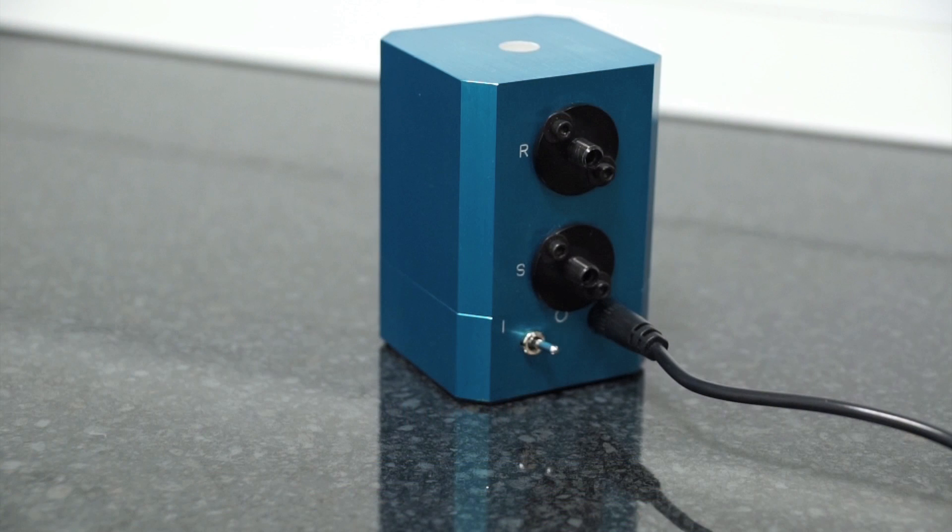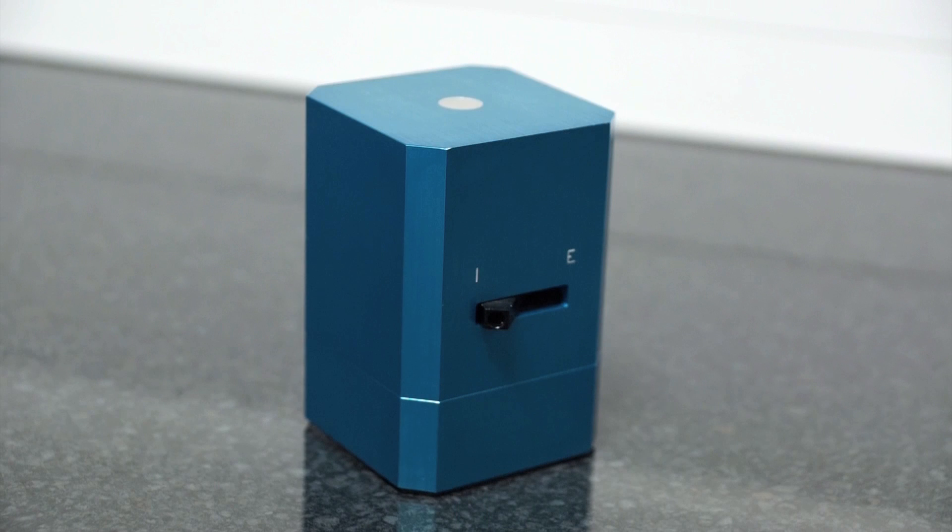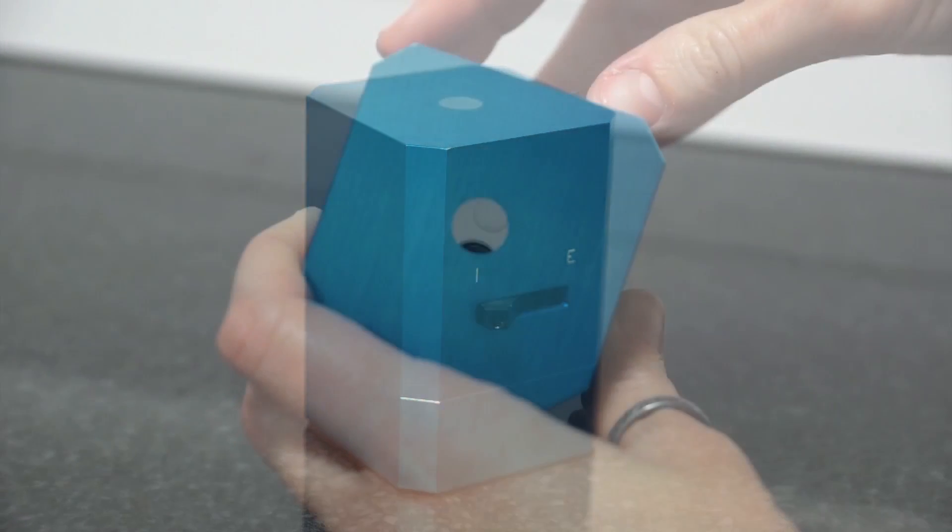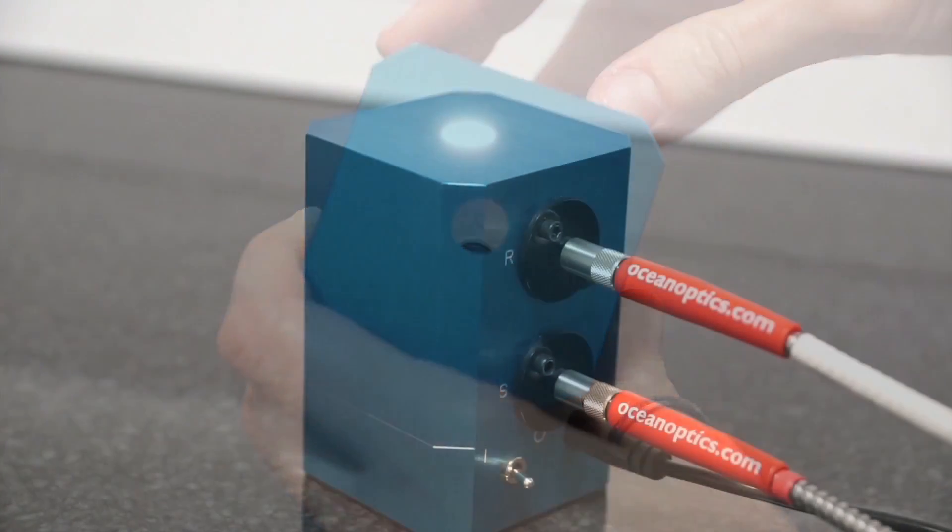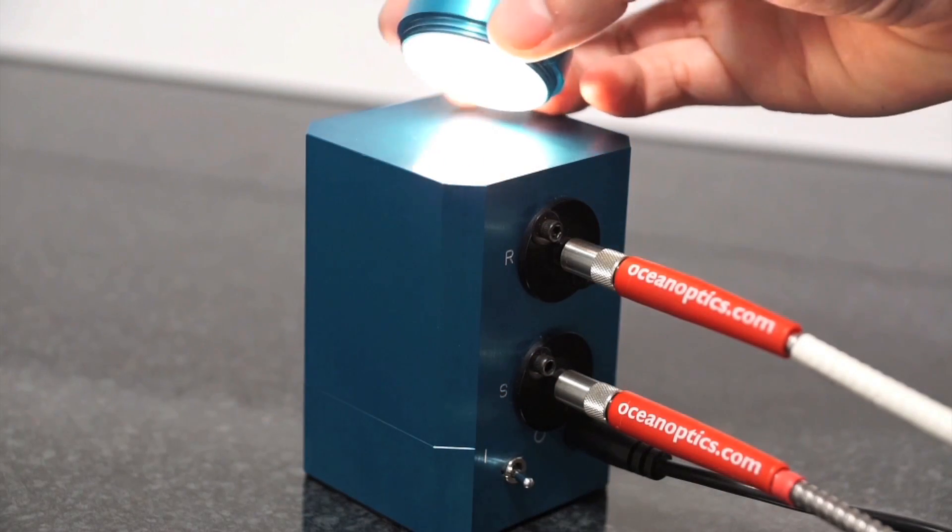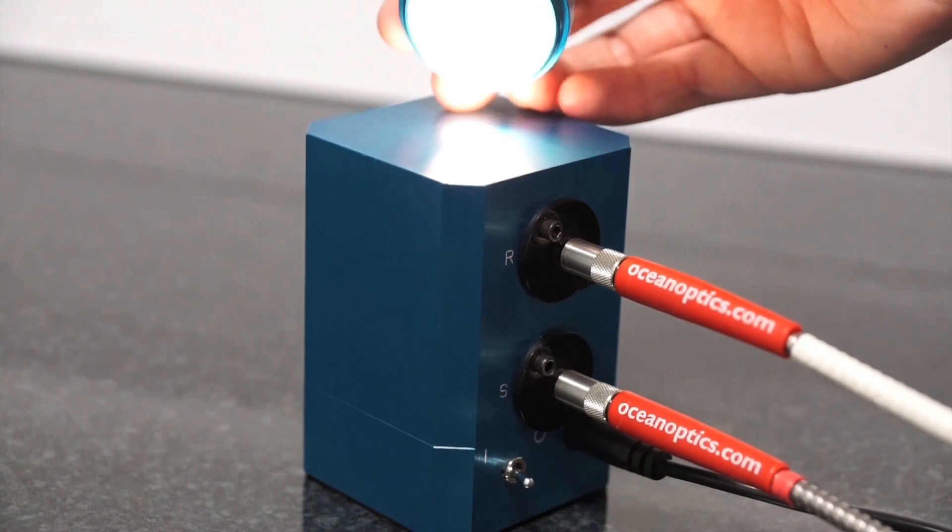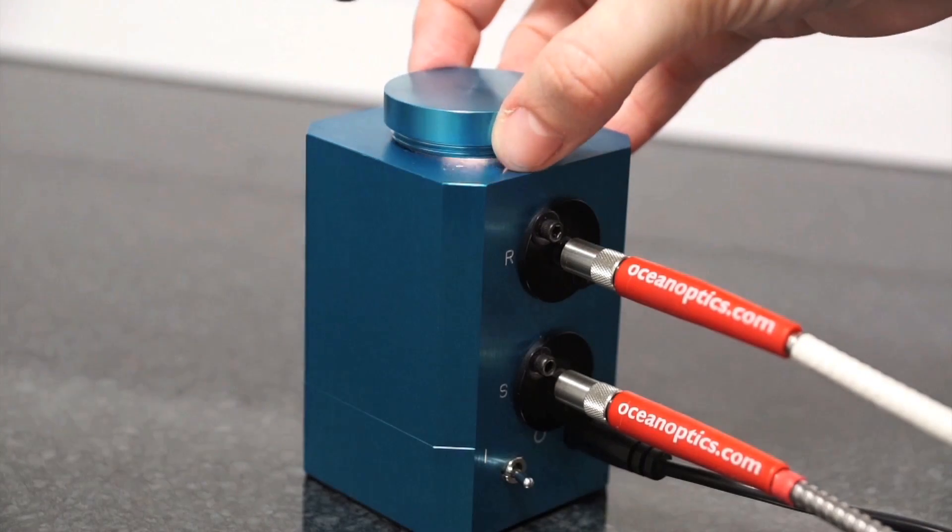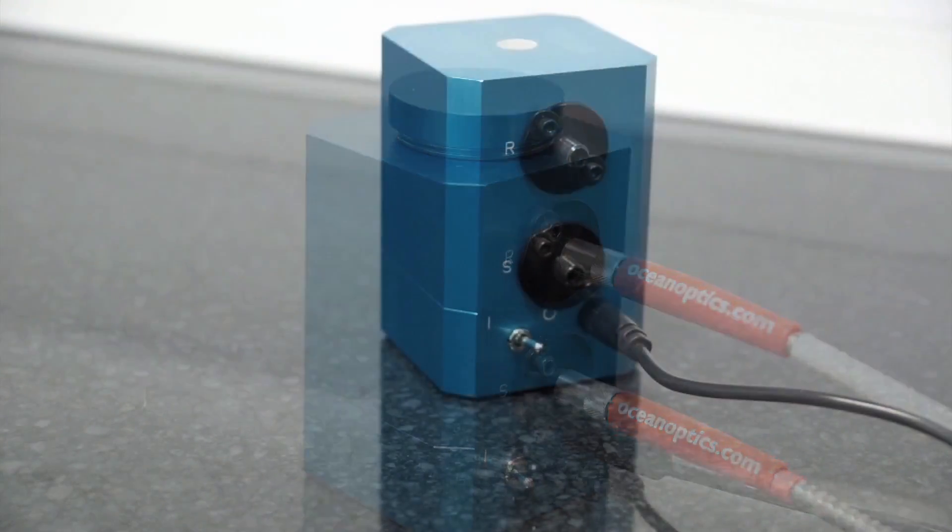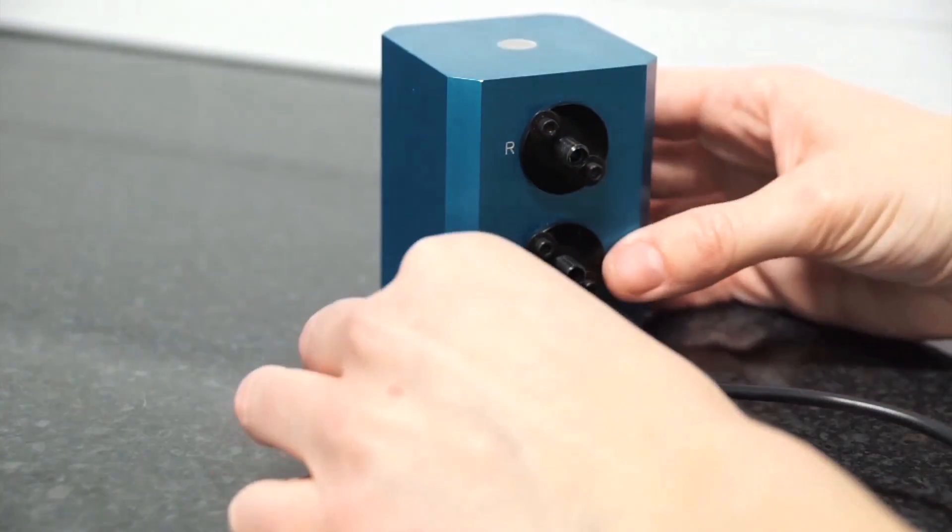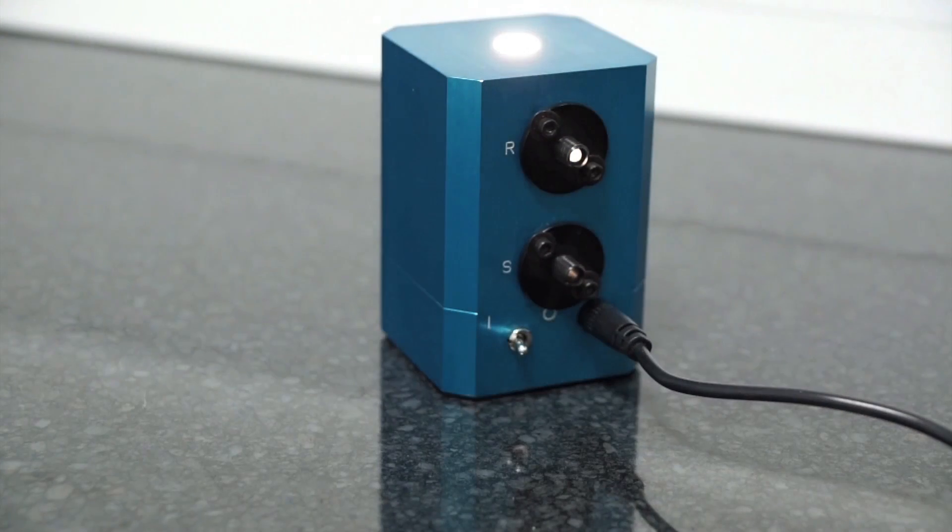An integrating sphere can be the perfect tool for many reflectance applications. It provides a larger collection area than a reflection probe and is excellent for maintaining a fixed measurement geometry between the sample and illumination source. It features an internal light source which delivers diffuse illumination to the sphere.